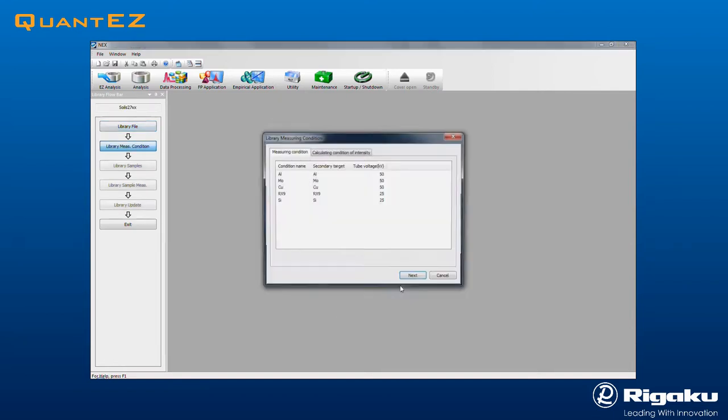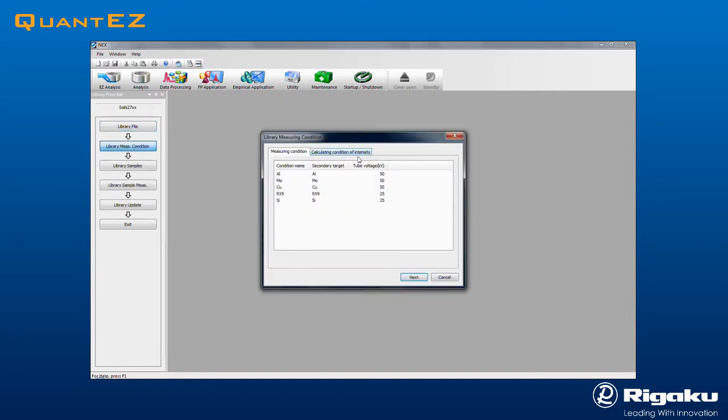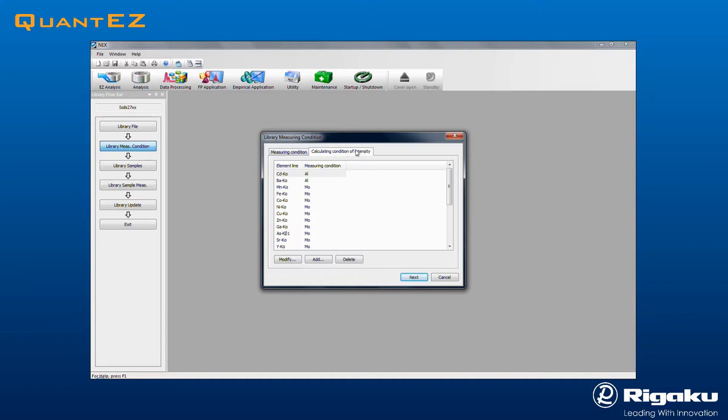Clicking Next brings up the Library Measuring Condition screen. Then click on the Calculating Condition of Intensity tab and enter the elements and measuring conditions for the standards to be used in the library.